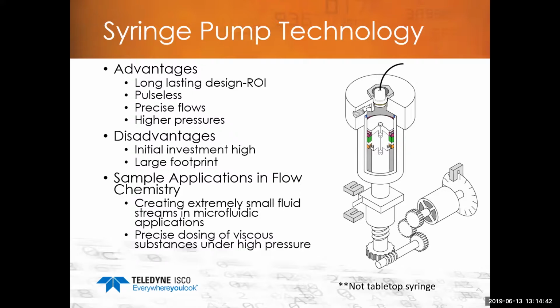Depending on the market you play in, you probably wouldn't use 30,000 PSI in the pharmaceutical market, but you might use it in the oil and gas market. So syringe pumps are able to do that. And I'm not speaking about tabletop syringe pumps where you just throw out the syringes. These are full-blown gear-driven syringe pumps. Disadvantages are that the initial investment can be high and sometimes the footprints are large, but if you need that precise flow or pulseless flow, this is where you need to look when you look at the different types of pumping technology.